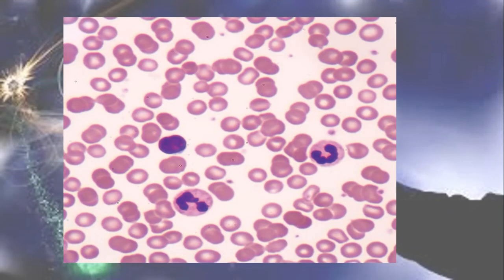This is how our blood smear is going to appear under the microscope. You are going to see a big number of red blood cells, which have a disc shape, biconcave structures. And you are also going to notice the presence of the white blood cells. They are less numerous, as you can see.